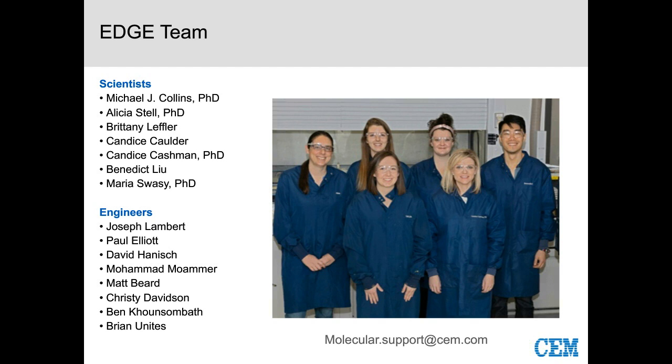So I actually have to apologize, because the answer really is no, because that PFAS unit is specific towards that particular application. However, if you order an Edge that has our standard tubing and so forth, that is applicable to a wide variety of applications, from environmental to food and pesticides to phthalates and plastics and so forth. But yes, the actual PFAS Edge that has all the considerations with the different tubing is specific for PFAS extraction.